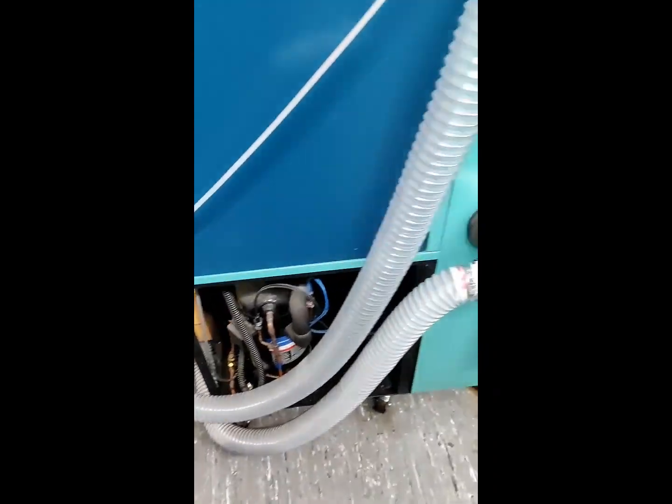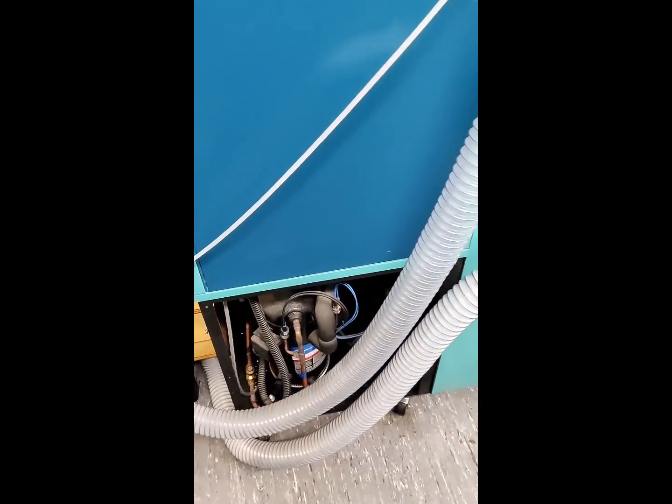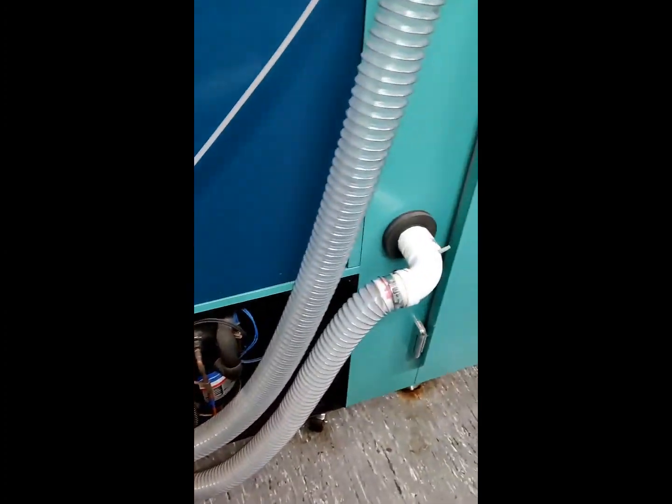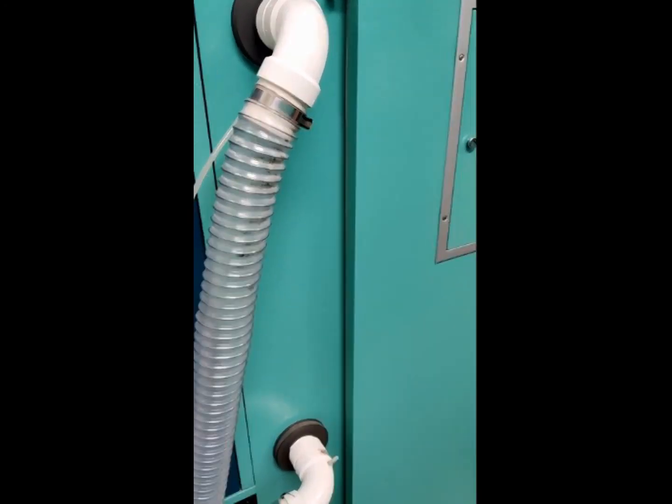These goofy looking pipes are used to allow fresh air to enter the chamber. More specifically, they're important in regulating how much carbon dioxide can enter the system, as well as how much oxygen can leave the system, based on the specific growth conditions of the plants inside.